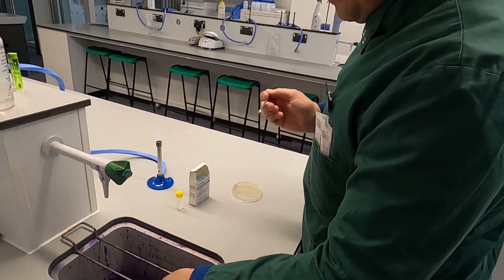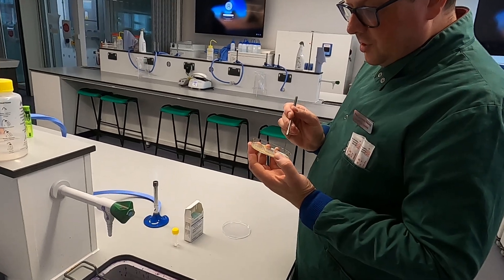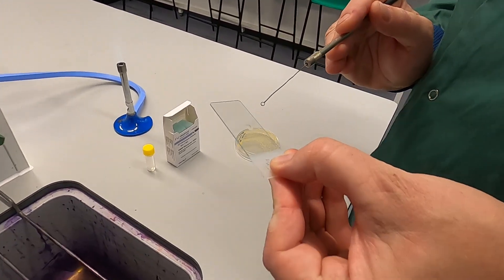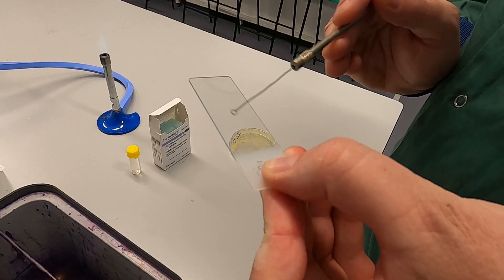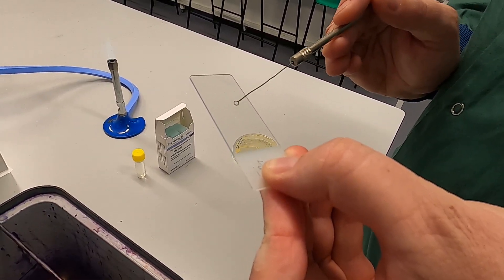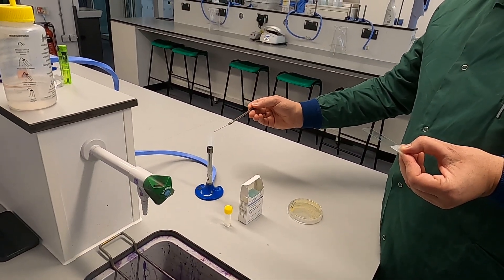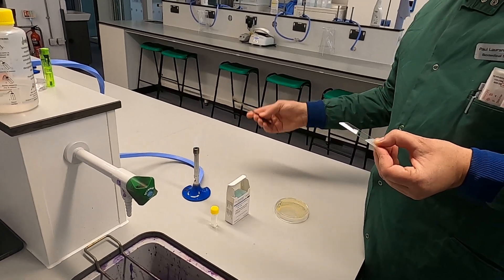Once that's on there, return to your colony and pick a single colony. You don't need an awful lot — just enough to get into the loop — and then you apply it to your water. Make sure you mix it really, really well. It doesn't matter if it's even; there's nothing neat or fancy about this, you're just simply mixing it. Ensure you then flame your loop again to make sure you have no contamination.